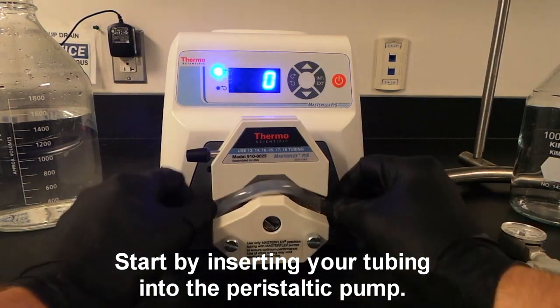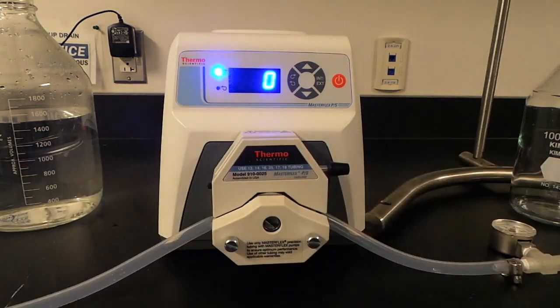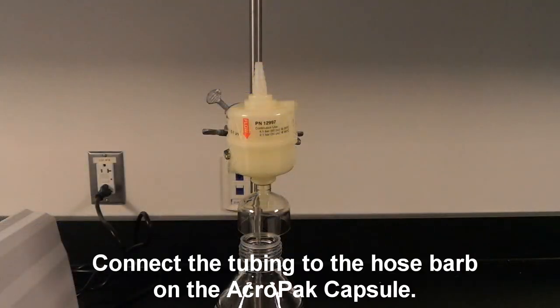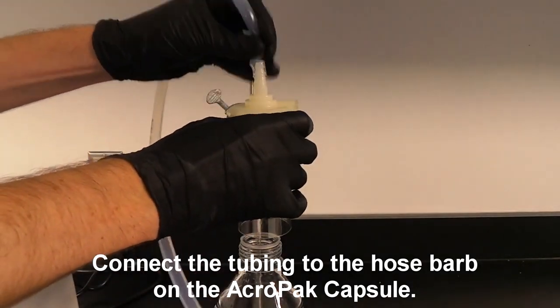Start by inserting your tubing into the peristaltic pump. Then, connect the tubing to the hose barb on the Acropac capsule.